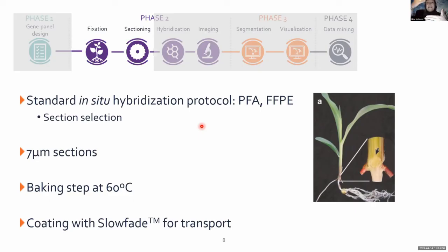And if you're slightly out of focus of your tissue, of course, that is the outcome you will get. And you do this pretty much blind. I mean, if you have experience in sectioning, you learn this, but this is something to take into account. Typically, we use sections that are 7 micrometers thick, but I also know 10 micrometers works.